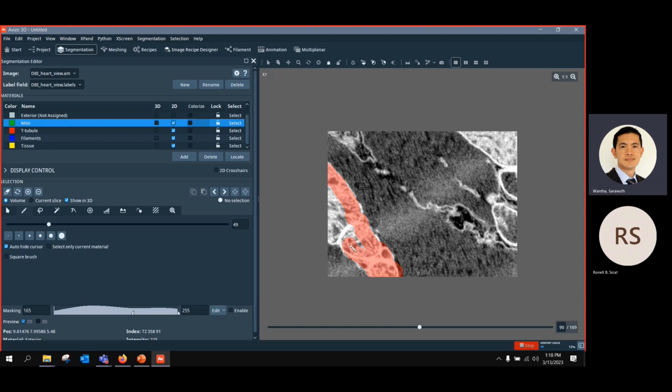Also, the same as deep learning, you need to spend some time painting them. Just one slide should be enough, just to keep all the information about your images. Like here, maybe a bit here. So this should be mitochondria. So I go to mitochondria and add it. Now it's highlighted in green for mitochondria.